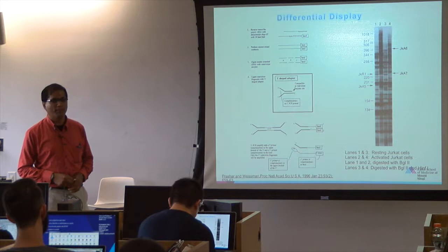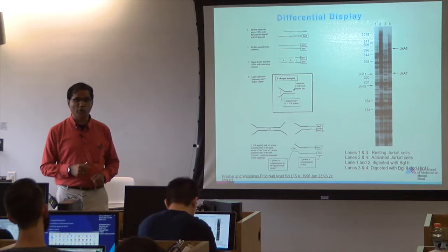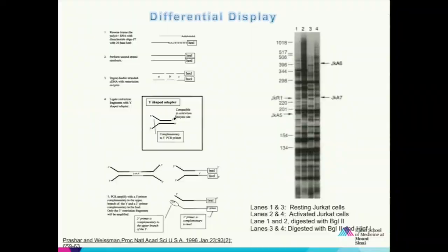But what is important is that this is one of the earliest techniques where a Y-shaped synthetic adapter at both ends was used. The same adapters are used in various different techniques, including next generation sequencing, which we'll come to understand. This is one of the earliest techniques where this concept was developed. Any questions so far?